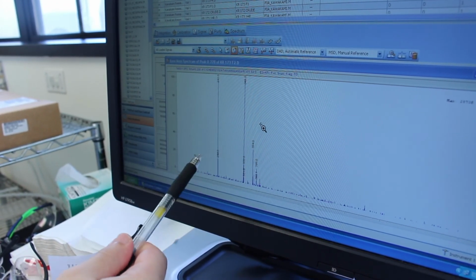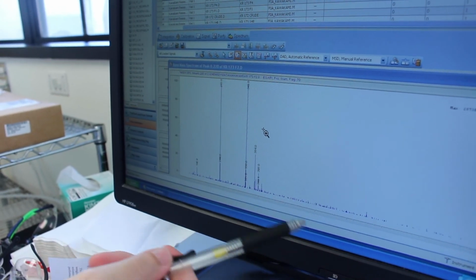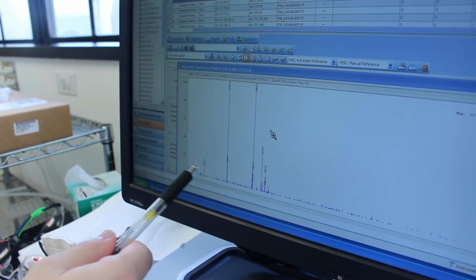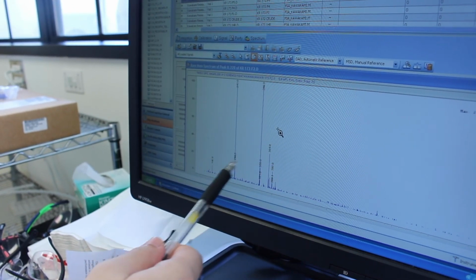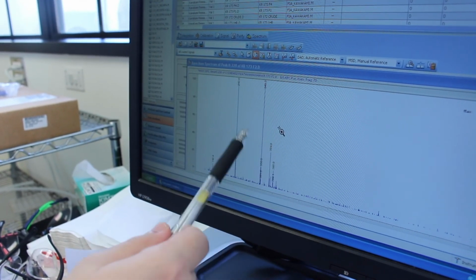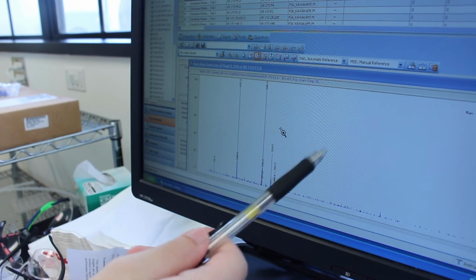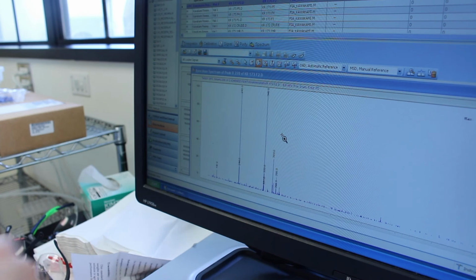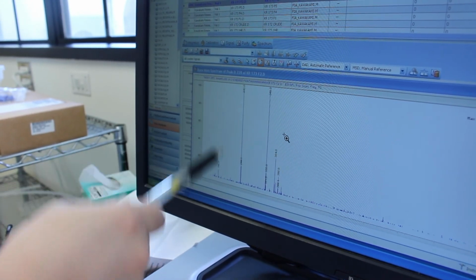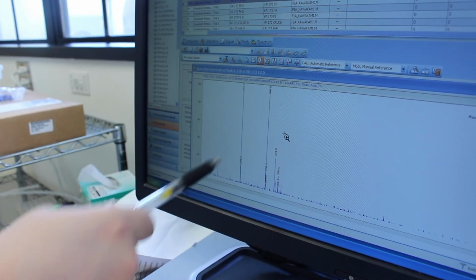And the reason being is because in the mobile phase, there's some acid, and when the OH of the trityl alcohol is protonated, it leaves. And when it leaves, OH. So subtract the mass of one OH group, which is 17, and you get this peak right here. So this is the trityl cation you're seeing here, trityl or triphenyl cation.